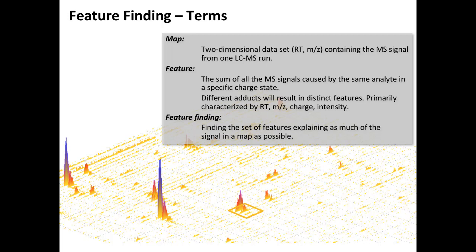One's peptide, one's small molecules. Yeah, that is one aspect. So the patterns will look different, and the charge states are different. But they will be smaller, because we usually run shorter gradients for metabolites, where we use a couple hours in proteomics. We usually get away with 10, 20 minutes in metabolomics. And we have a narrower mass range. Rather than going up to 2,500 Dalton, we go up to, say, 1,000. And that gives us a better resolution.